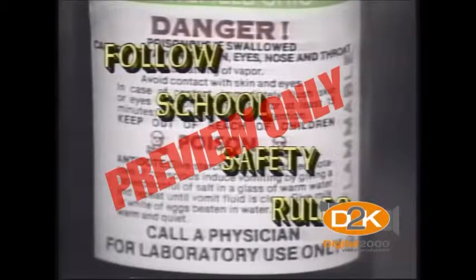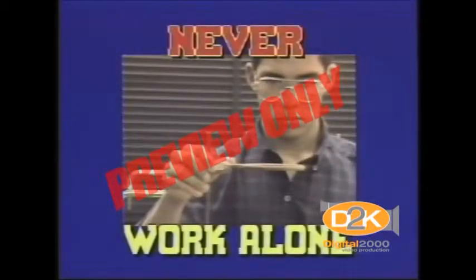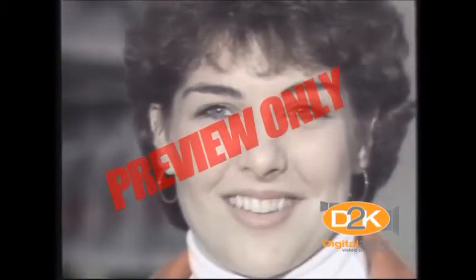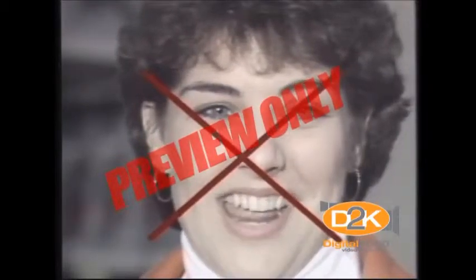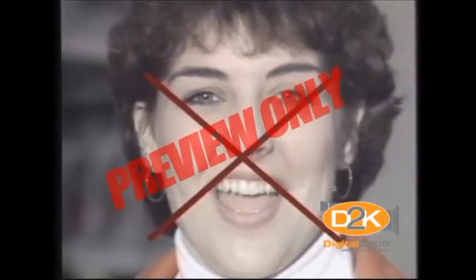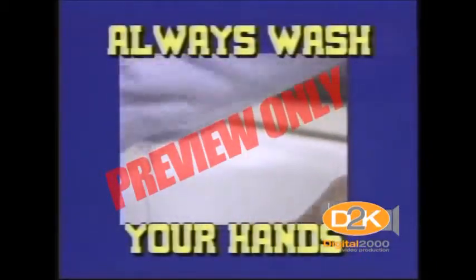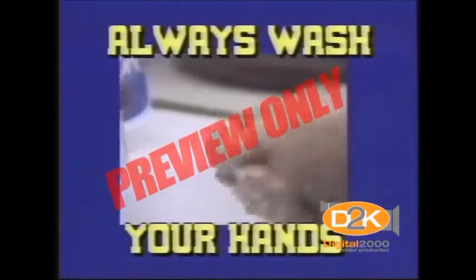Let's begin with some basics. Never work alone in a science lab or chemical storage area. Never eat, drink, smoke, or chew gum or tobacco in labs or storage areas. Chew gum? Yes, chemicals can be absorbed into the gum, and when chewed, the chemicals can be ingested. Never use your mouth to blow or create a vacuum in a chemical tube or pipe. Always wash your hands before and after work in a lab, also immediately after any spill cleanup.